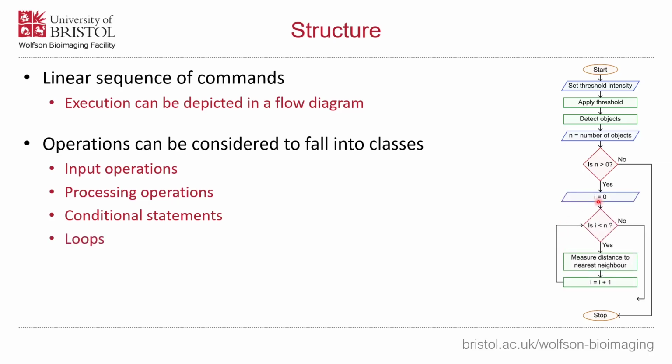This next block, all of this here, could be considered as a loop. In this case, this is a while loop. We set our value of i equal to 0. i here is a variable. It's just going to store this number. It allows us to access the particular iteration in this case, so think of that i standing for iteration.